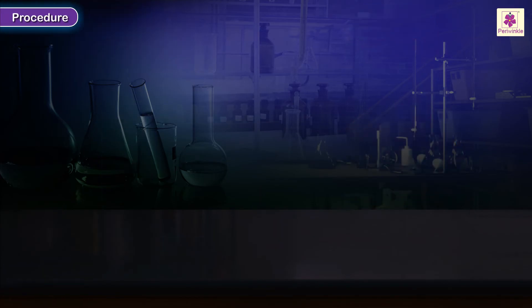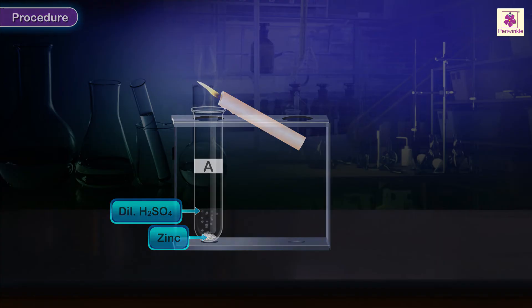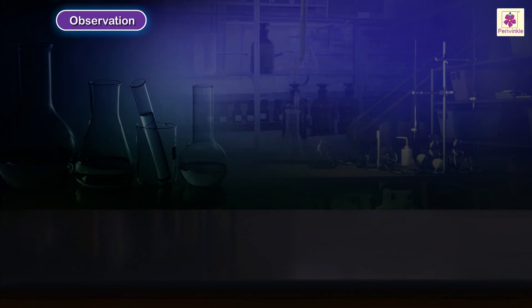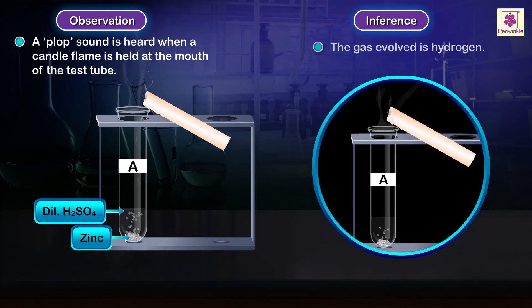Procedure: Hold the flame of a burning candle at its mouth and observe the effect. Observation: A pop sound is heard when a candle flame is held at the mouth of the test tube. Inference: The gas evolved is hydrogen.